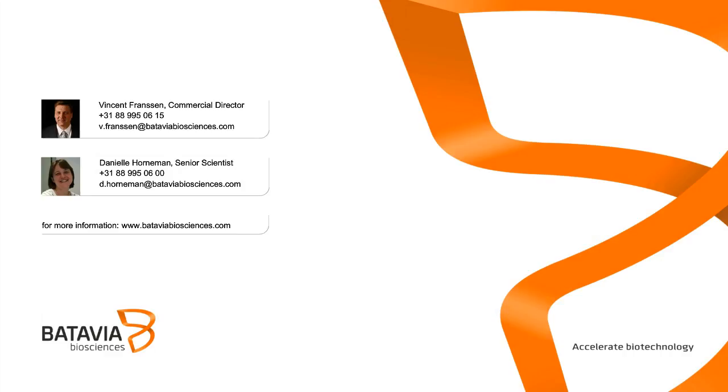Someone says, on what kind of projects does Batavia use DOE? Yeah, really several projects. So we have it really in the beginning of the process development. So for example, where we have to do medium selection for USP process, we use DOE a lot for defining optimal conditions in chromatography steps in the purification.